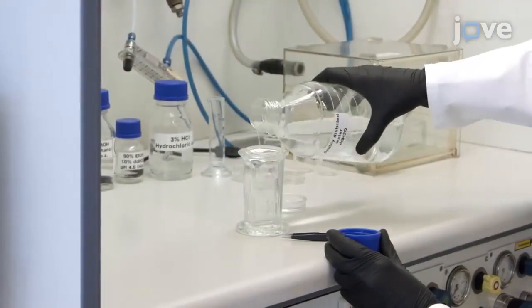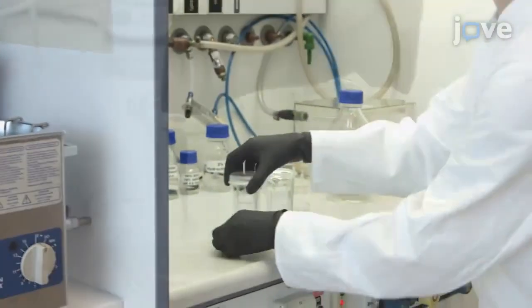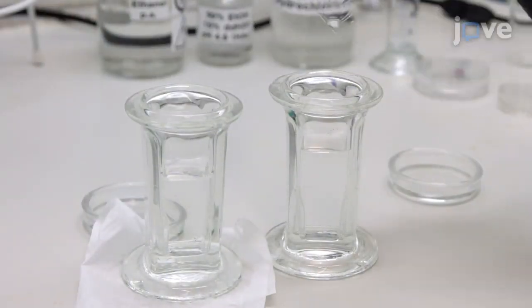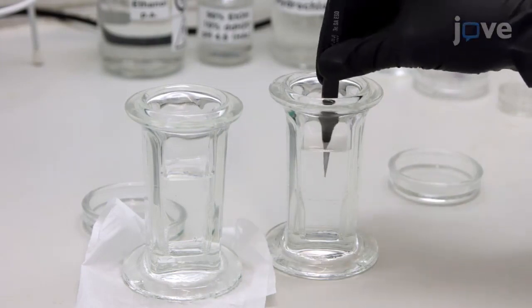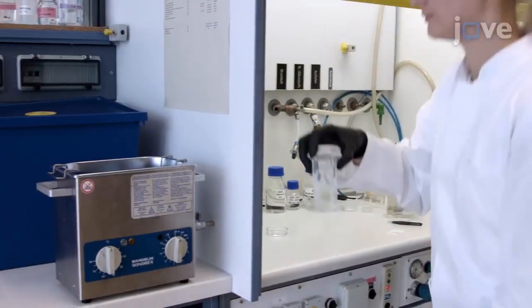After this, replace the hydrochloric acid in the staining jar with doubly distilled water, making sure not to let the glass surface dry. Seal the jar with the lid and place it back in the ultrasonic bath for another 10 minutes.